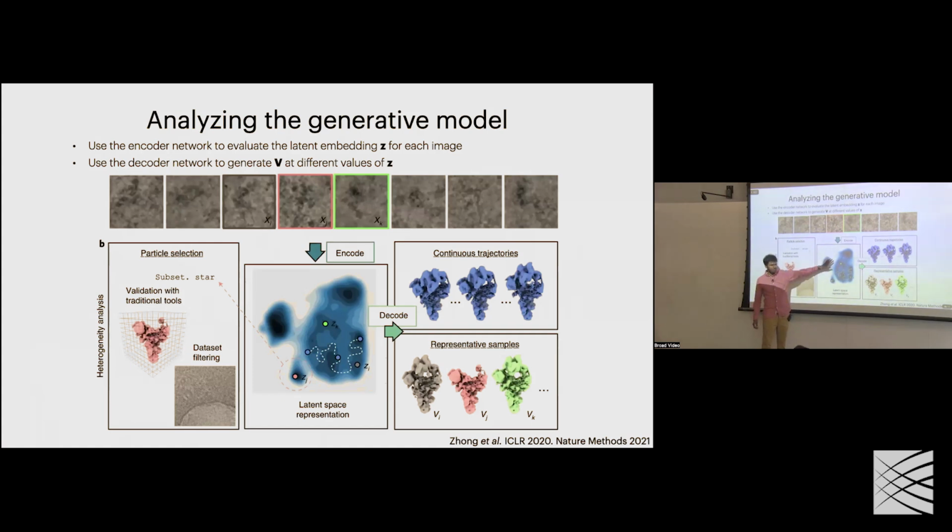You can plot them, and so you get a plot like this. Again, each one of the points corresponds to that low dimensional latent representation for one of those images. And so this gives us a sort of visualization of the empirical data distribution.